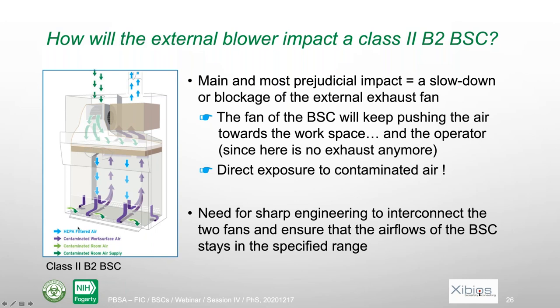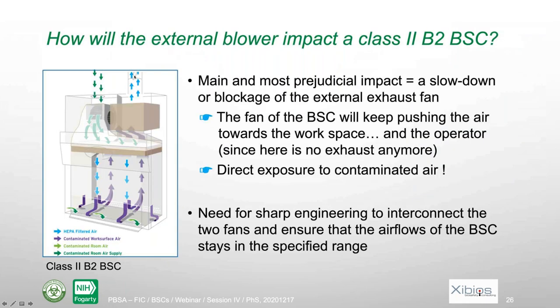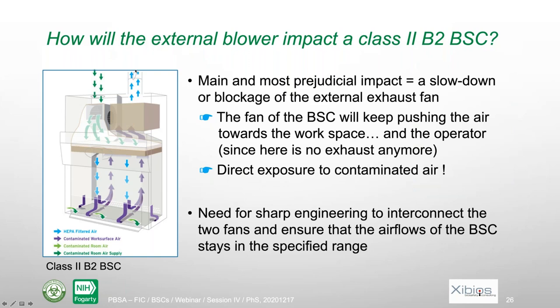That means that clearly, if there is a problem with this fan, especially if it slows down, you are likely to be exposed. So that's a very dangerous situation, actually. And this is why the two blowers need to be connected. The two fans need to be connected in a way that if this one slows down, the other one reacts immediately in order not to create an overpressure and compromise the safety of the people.